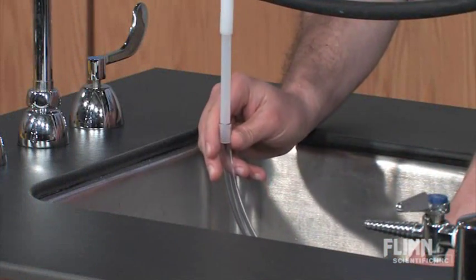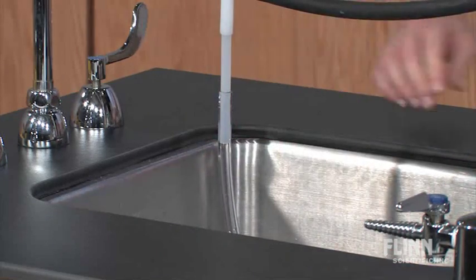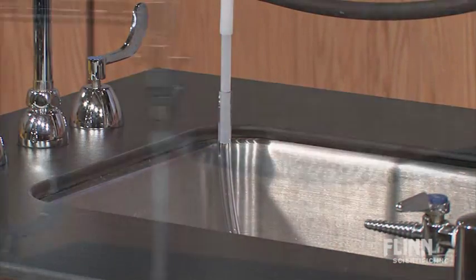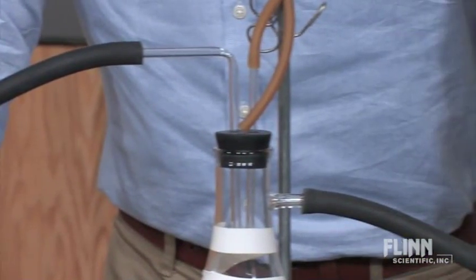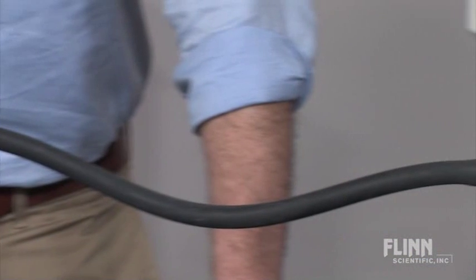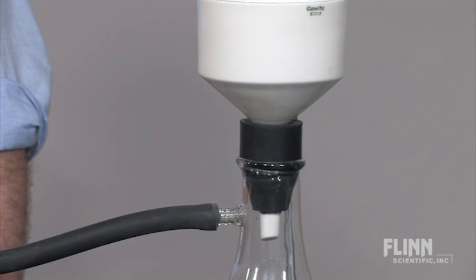Once the aspirator is tightly secured to the faucet, attach a length of 3/8 inch diameter tubing to the water outlet of your aspirator. The tubing should be long enough to reach a drain with a little bit of slack. Aspirators use large amounts of water, so be sure to direct the tubing into a clear drain to avoid potential flooding.